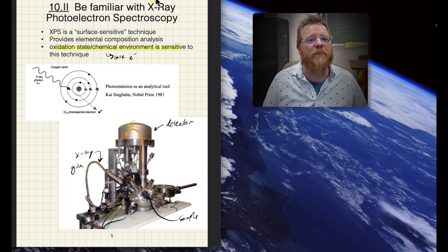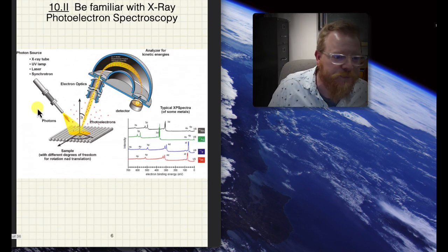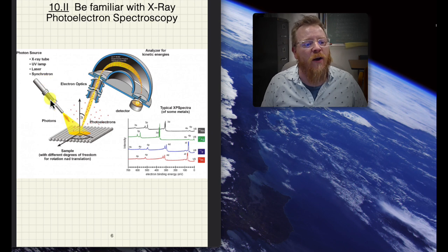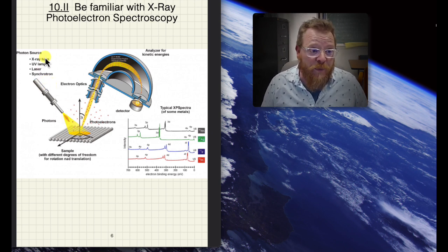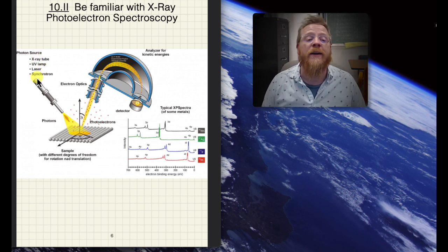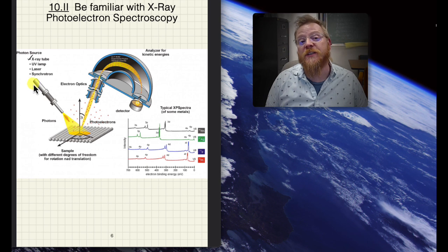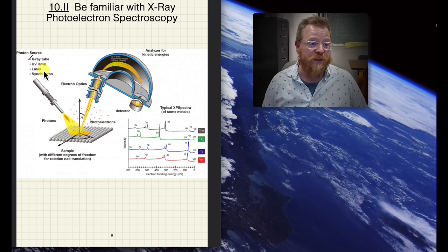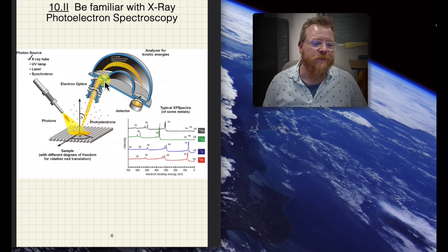So we can see a better schematic representation of that here in this slide. Again, we've got our photon source, and this could be any number of these types of wavelengths depending on what type of photoelectron spectroscopy we're doing. As noted, if we're doing an X-ray, then we're doing XPS, but we could also use these other sources of radiation to do a photoelectron spectroscopy technique as well.